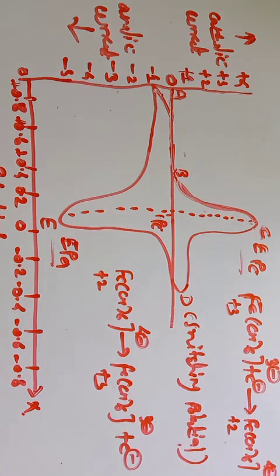If we see next, that is at point D, there is a reversal of scan direction, and this potential is called the switching potential.